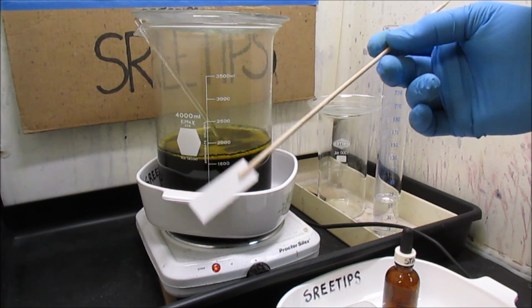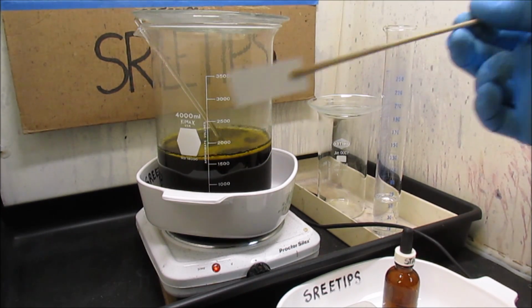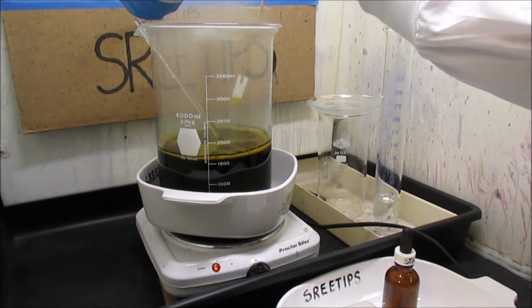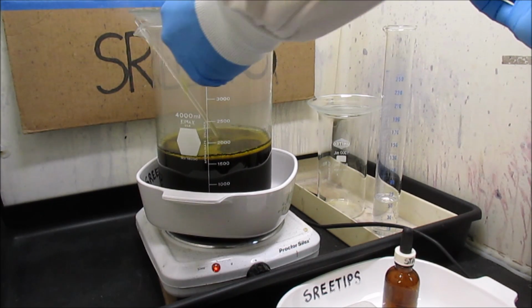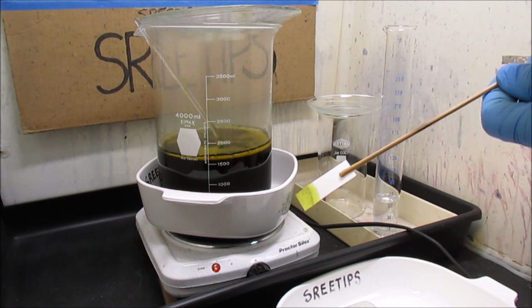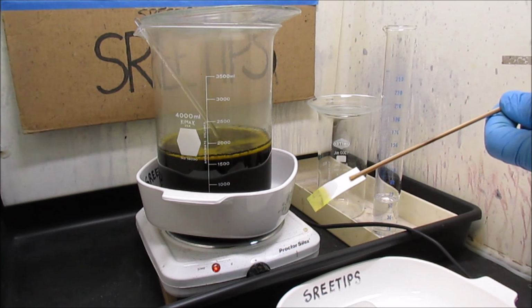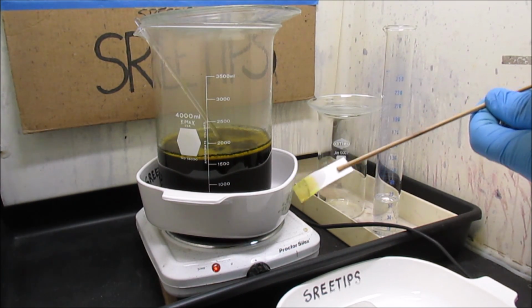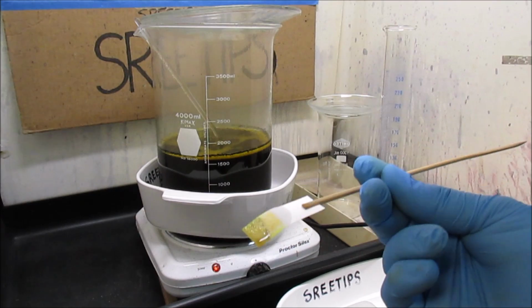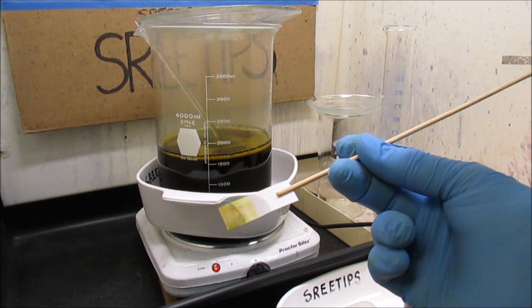Down in the beaker here with a piece of filter paper on the end of a bamboo skewer, we're going to do a stannous chloride test here. We've got an orange color going on there, which indicates platinum. It doesn't look like there's a whole lot in there.